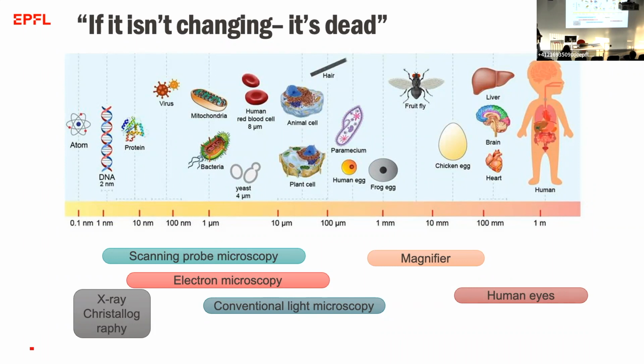Now that's super easy at microscopic scales, and we have great microscopes that go down to areas where we can really easily observe living things and biology in action. But there's a whole area that science is exploring at a smaller size scale where the available tools are not as forgiving in terms of imaging live samples. That's around bacteria and mitochondria. Obviously, we can see them, but it's difficult to observe them for a long time at high resolution without disturbing them.